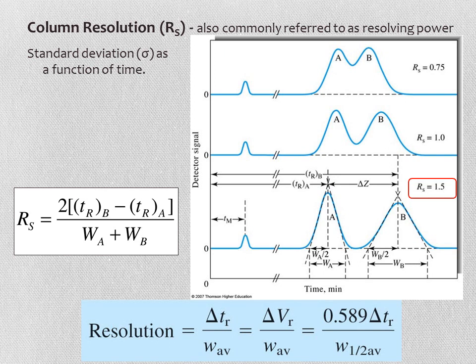Now, there's a ton of arrows and things on here, but really what we're thinking about with resolution is what is the standard deviation of the peak as a function of time?